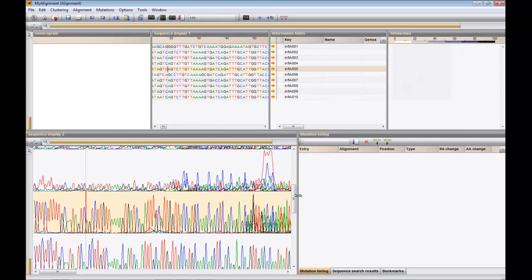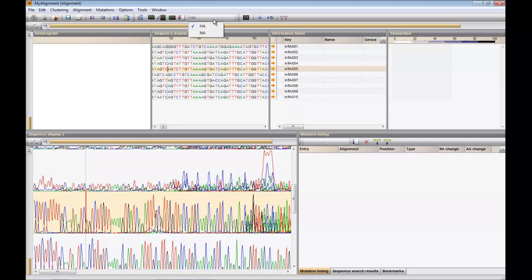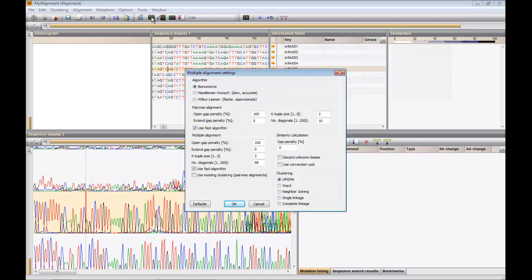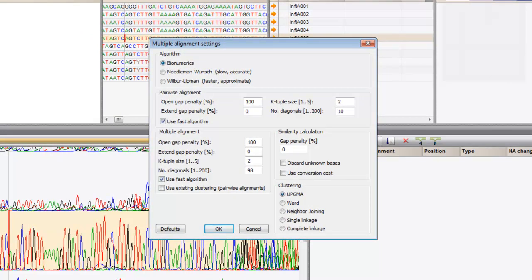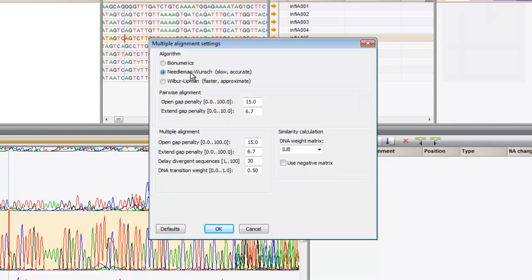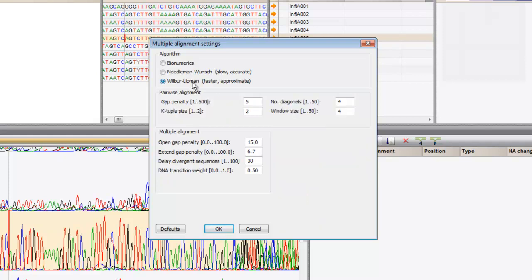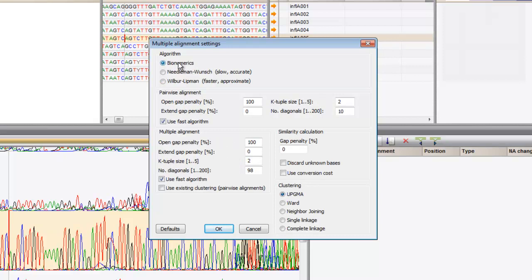To calculate an alignment, select the experiment above and press the alignment button. The algorithm for pairwise sequence comparison can be set to BioNumerics' own proprietary algorithm, a Needleman-Wunsch, or a Wilbur-Lipman, also known as ClustalW. Depending on which algorithm is selected, the settings which can be specified differ. For this dataset, I will work with the BioNumerics algorithm and its default settings.